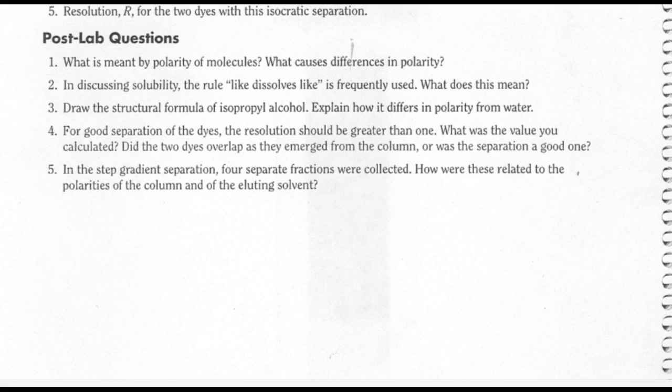But what you should look at is how it differs in polarity from water. We know what the polarity is of water, and I think you're probably going to see some similar features with isopropyl alcohol, but I think you'll also see some features that might cause it to be a little different.